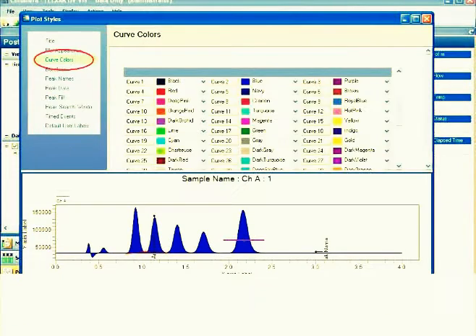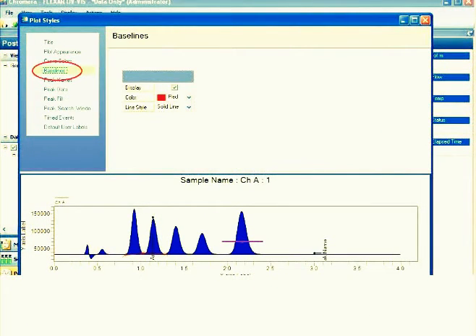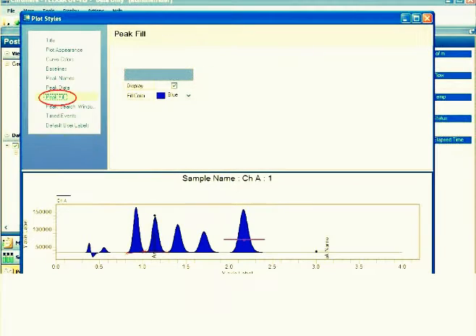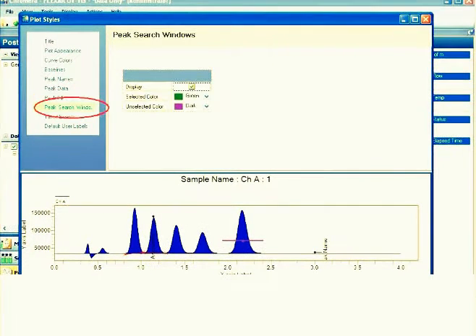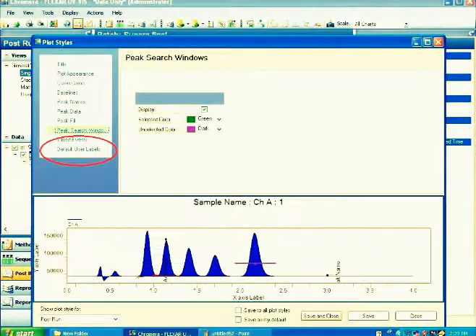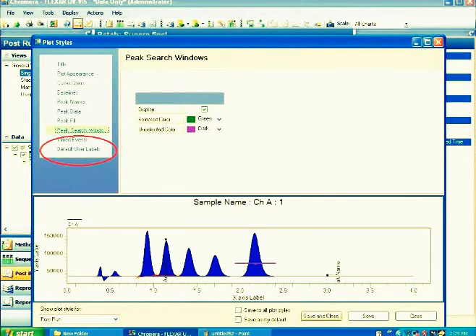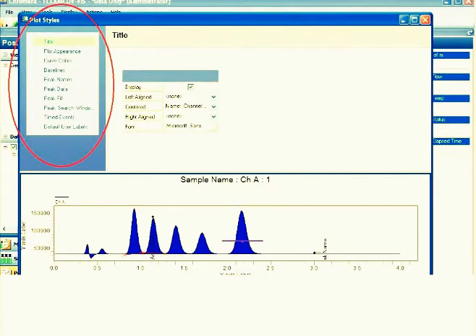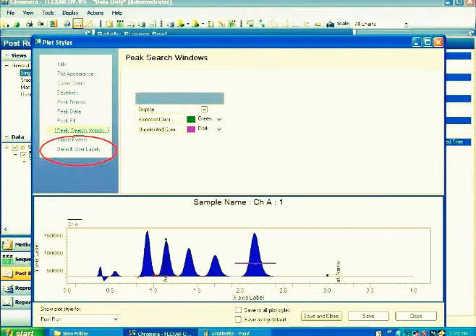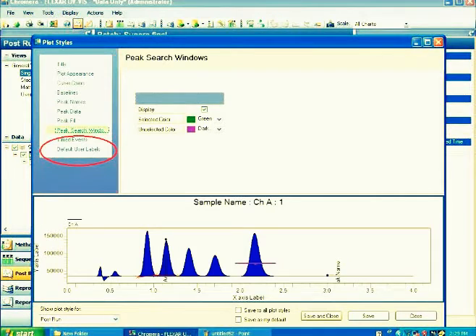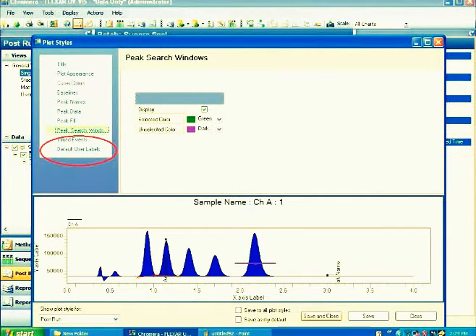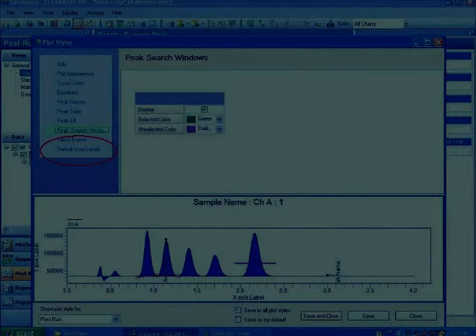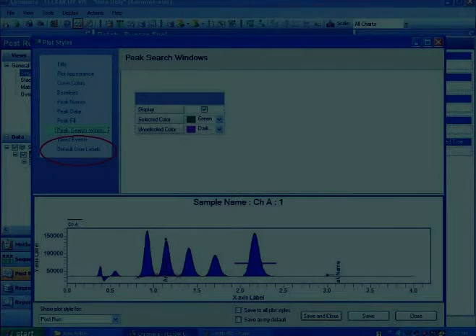Here are the title, plot appearance, curve colors, for the baselines, peak names, peak data, peak fill color, peak search window, time events. Basically, this command lets you edit the output of your data - what color you want, what is the appearance. If you're lost, you can just click to use the default labels. The program will automatically do the labeling for you.